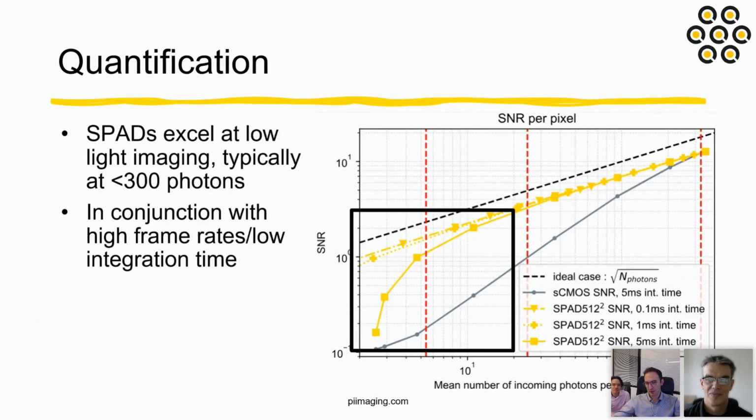When we talk about other super resolution techniques, more wide field, like localization microscopy or structured illumination microscopy, or potentially STED, in wide field we bring the possibility to really have high frame rates. For localization microscopy, this reduces the total acquisition time and improves the super resolution frame rate.